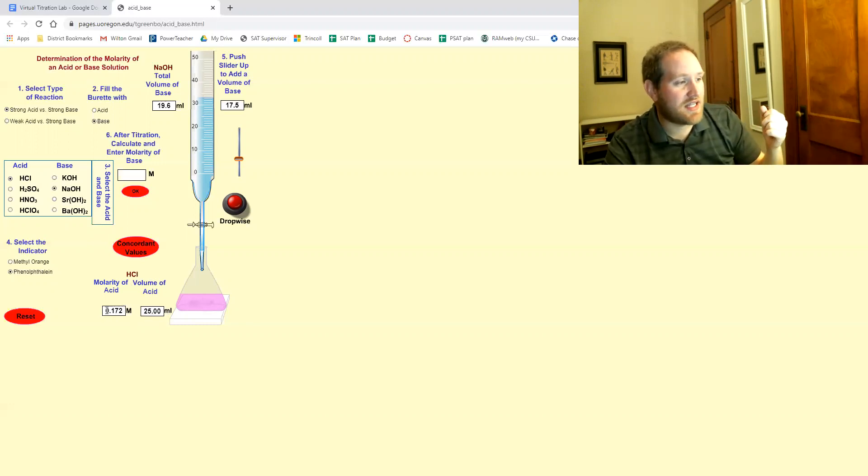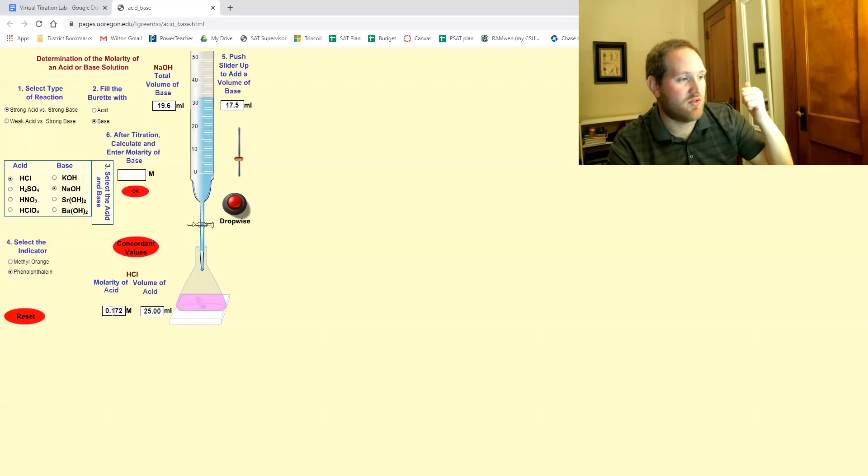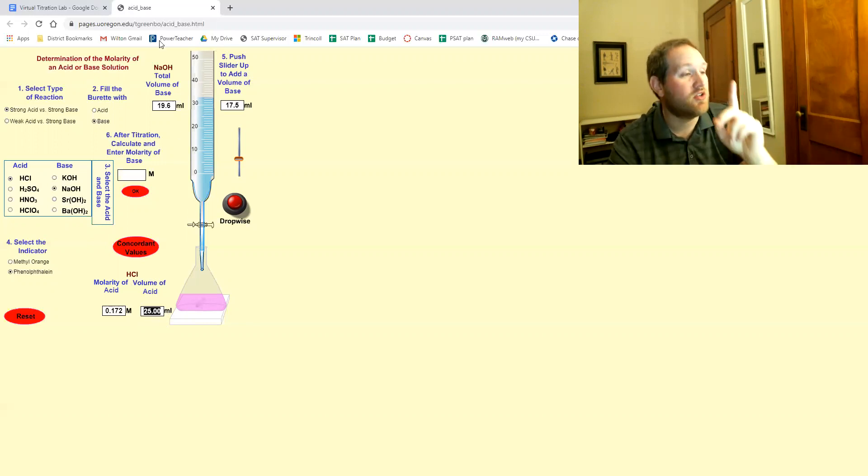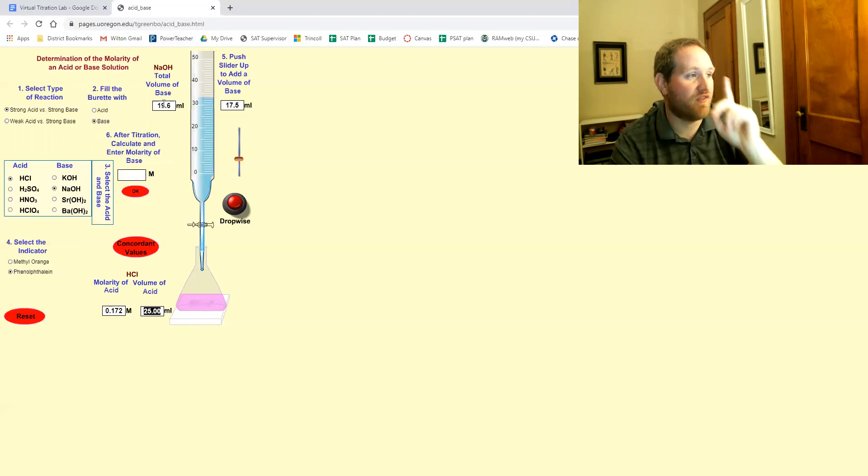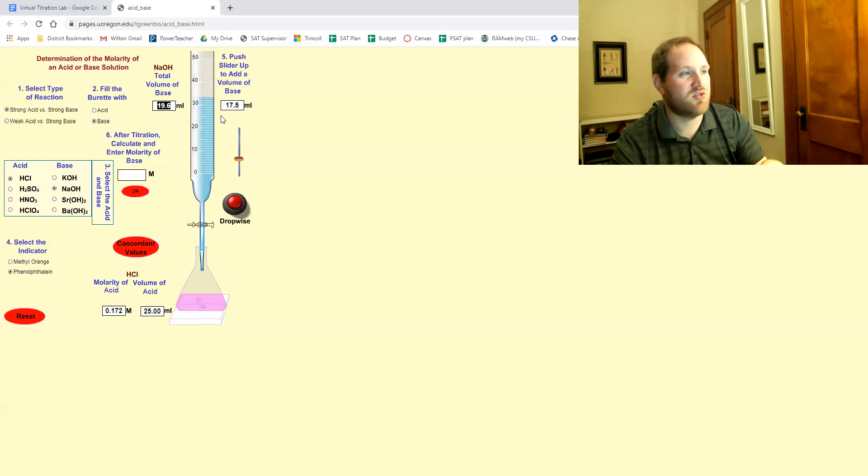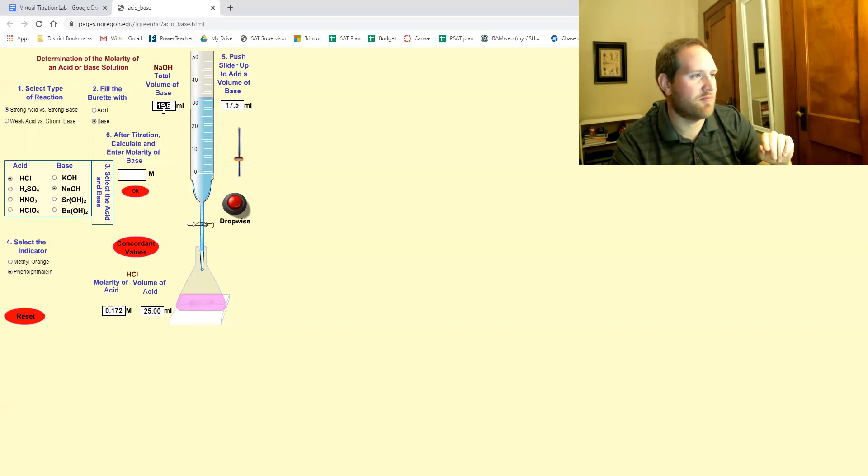So in your data table, you record the molarity of the known acid, the volume of the known acid, and now you're going to record the volume of the base that was added. It's this number, not this number. I almost wish this one wasn't here because it kind of messes it up.